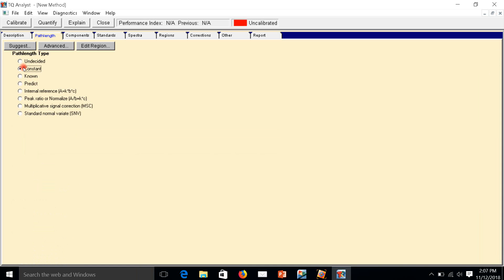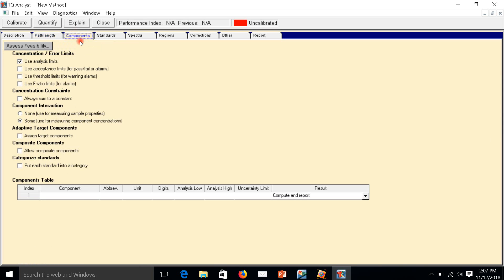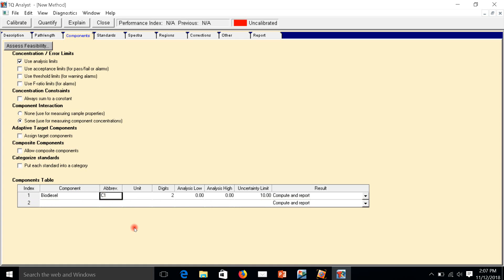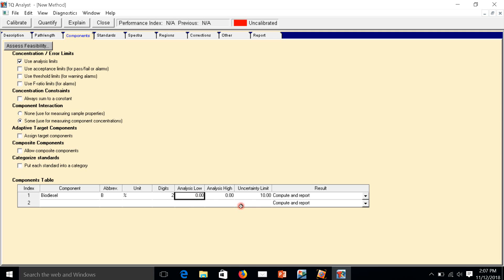The component is the parameter you want to build. Right here, biodiesel. The unit is percentage, digit is two digits, and analysis low to analysis high, because I will spread the calibration curve into two parts. The first one is from 0 to 30.